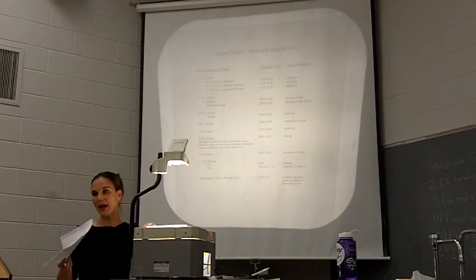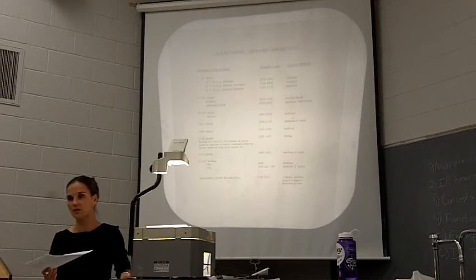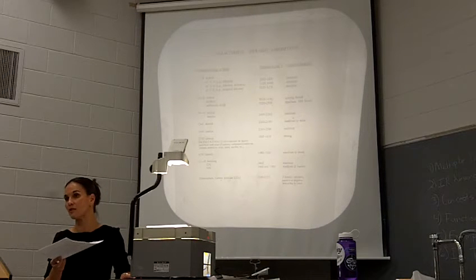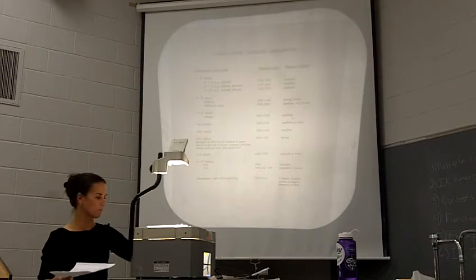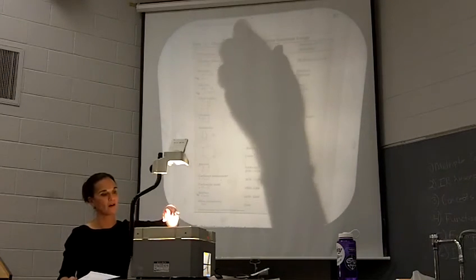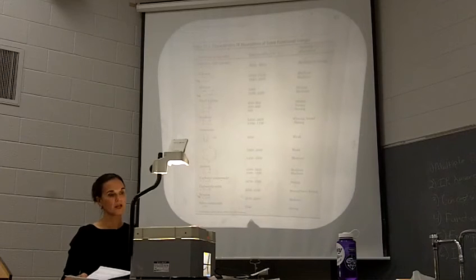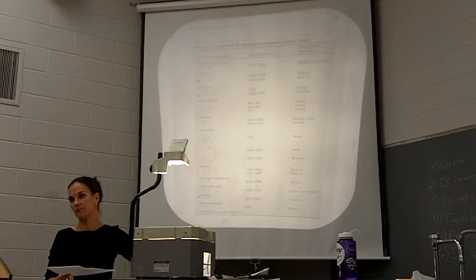In the back of your lab manual, there's much more detailed tables of different characteristic IR absorptions. So as we go into more complicated experiments, you're going to be using those as well. But start with this table for experiment 6, okay? Now, in your McMurry text, you have a very similar table. It doesn't list things as broadly, it's more specific in where the frequency is for those different stretches and bends, okay? So this is table 12.1 in McMurry, which is going to give you basically a similar type of information, okay?